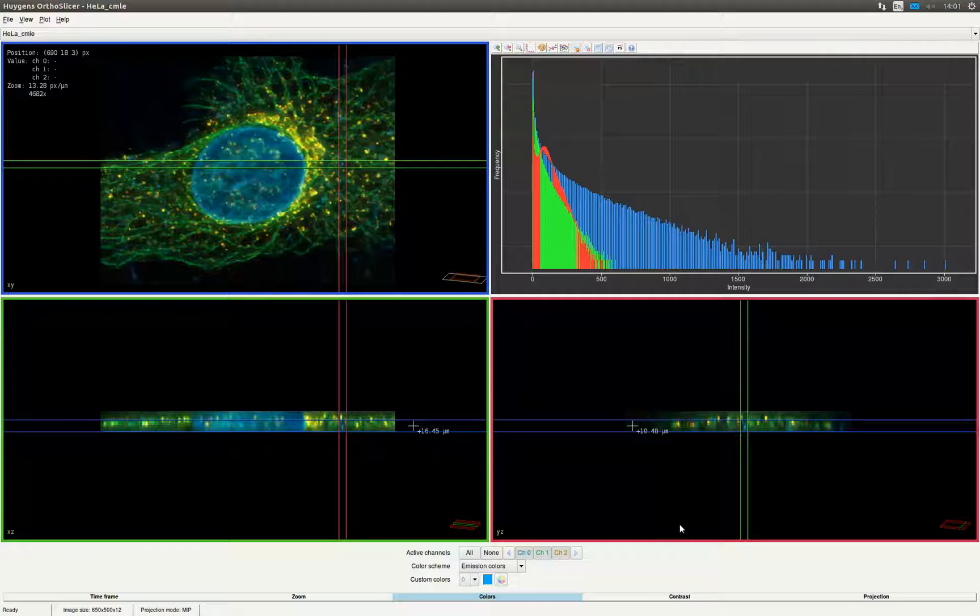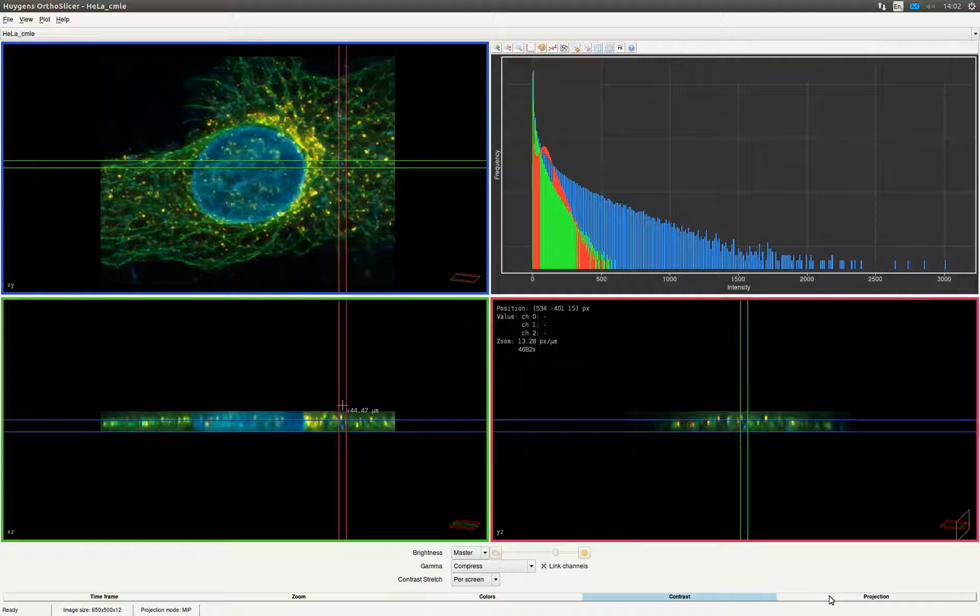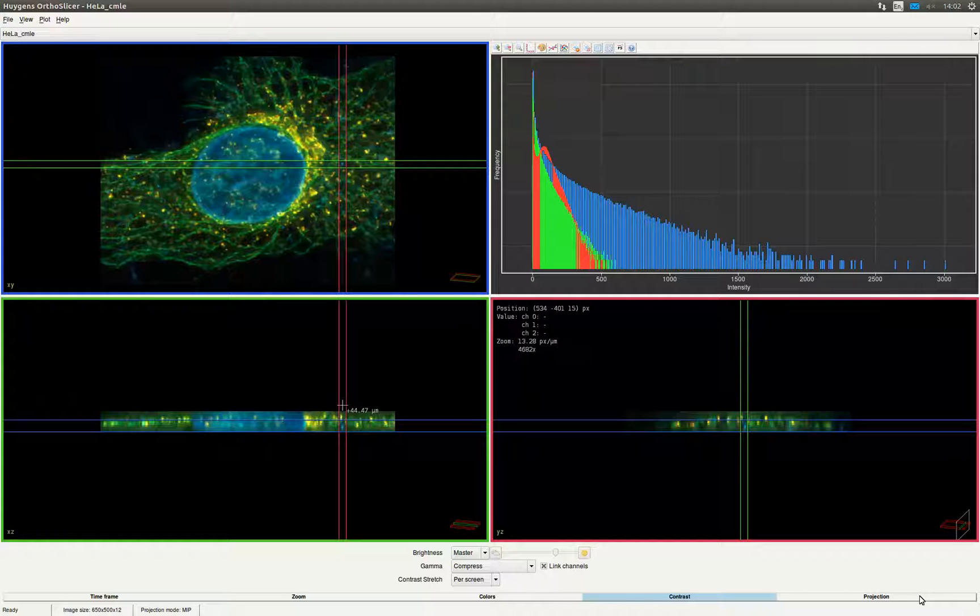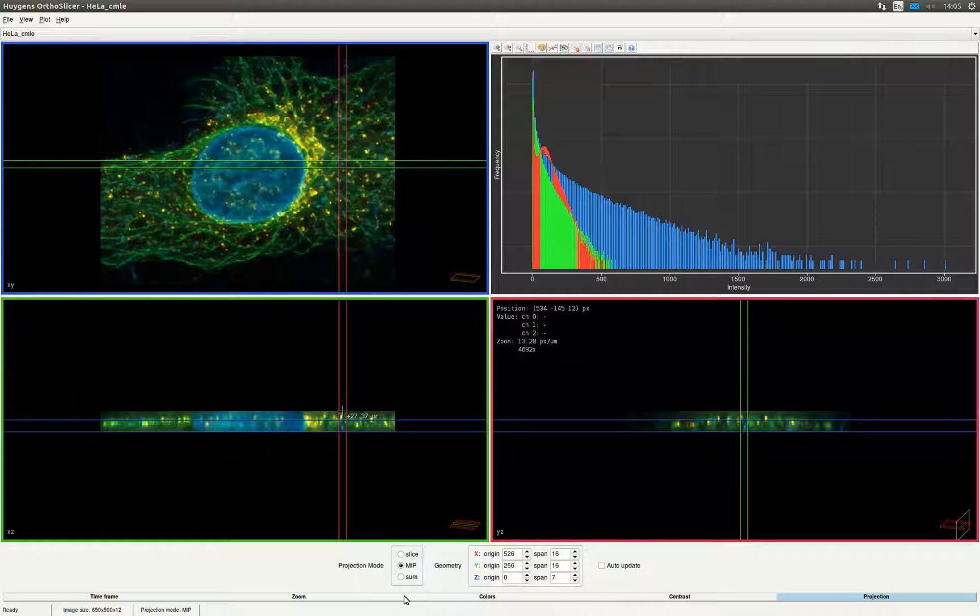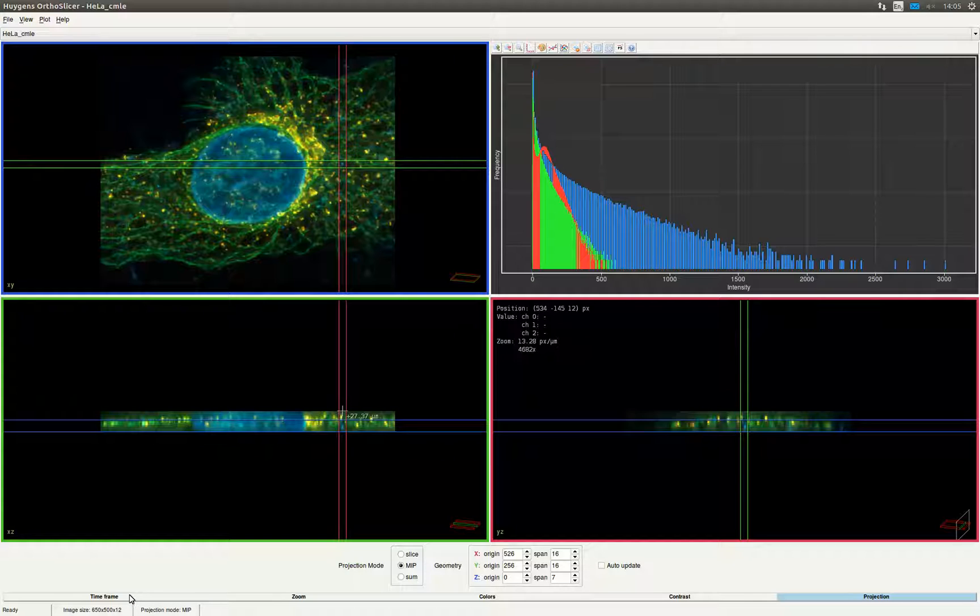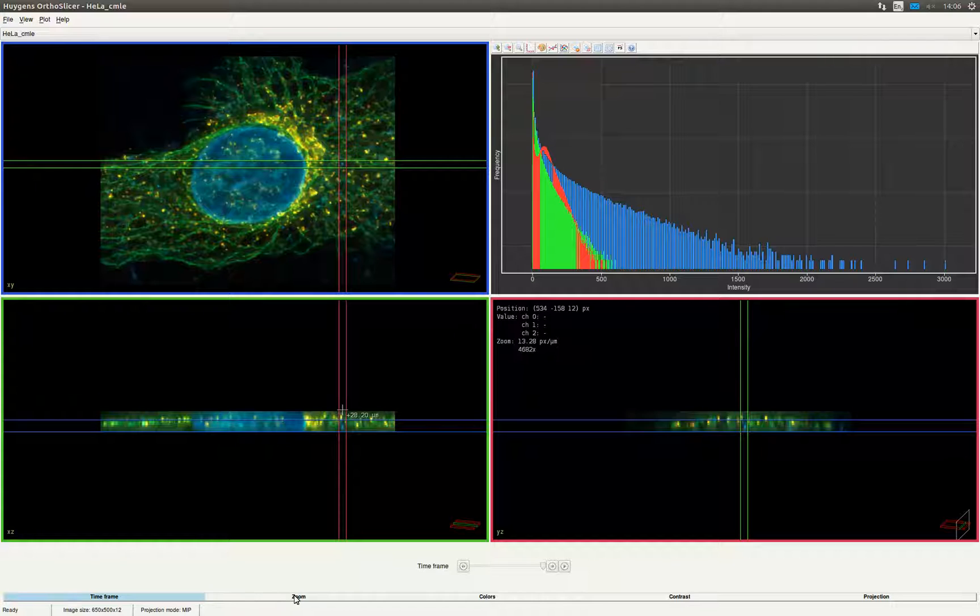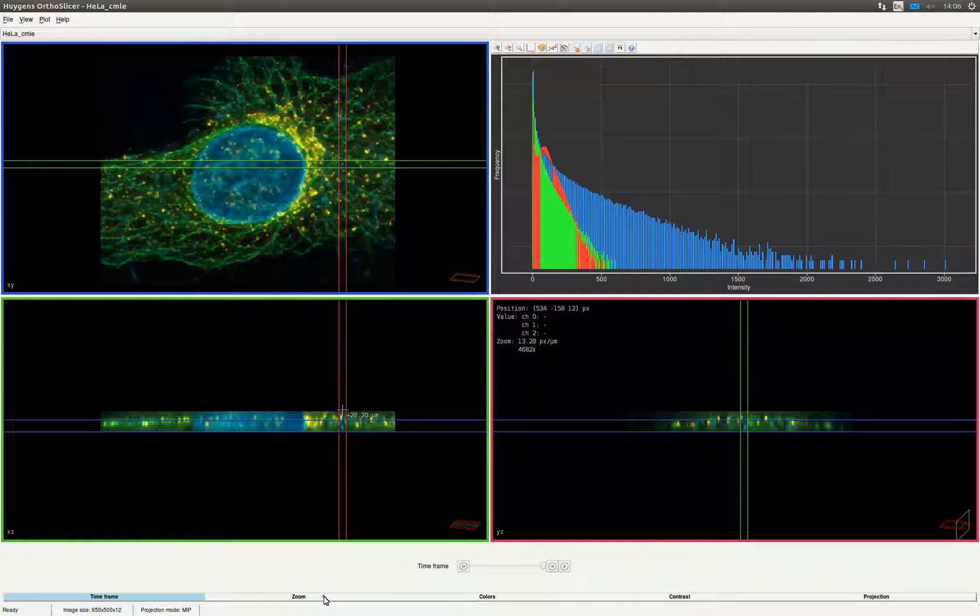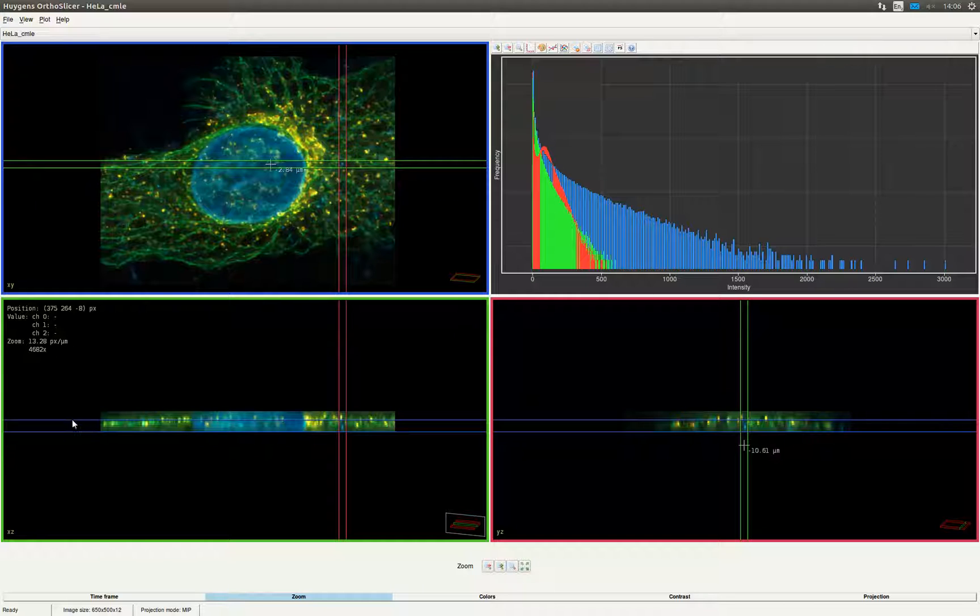In the color tab you can change the colors of each channel by selecting a color scheme or setting a custom color. You can also activate and deactivate channels you want to view. In the contrast tab you can adjust, like in the twin slicer, the brightness of the channels and change the gamma. In the projection tab you can choose the slices to project. You can adjust the position and width of the orthogonal selection. This can also be done by dragging the lines on the image. In case the image has time frames you can move through them using the time frames tab. With the zoom tab you can zoom in and out of the image. It is also possible to do measurements in the same way as in the twin slicer.